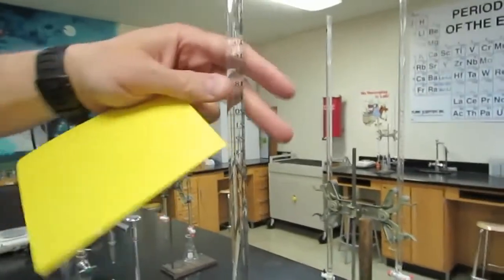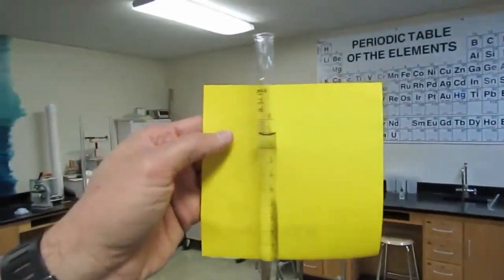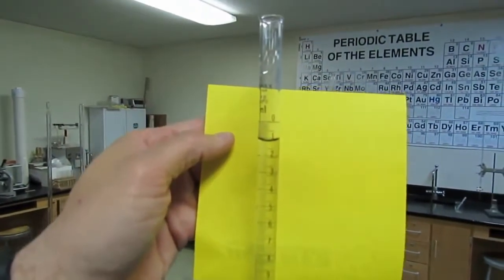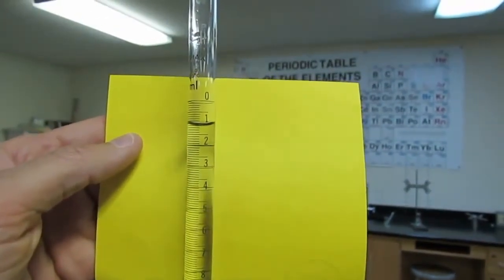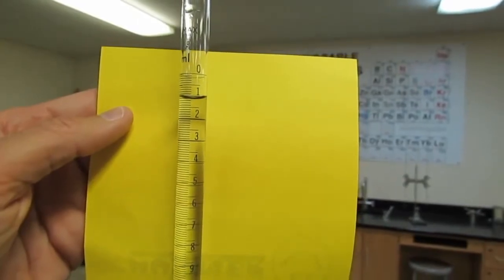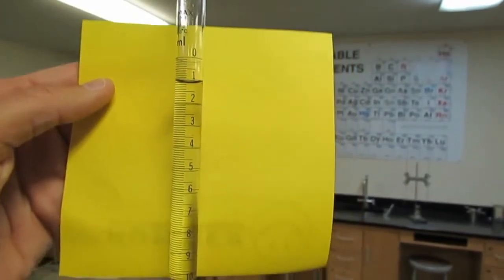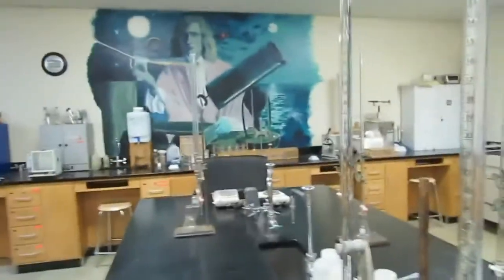For my initial acid reading, let me turn the burette so we can read that. It looks like that's going to be between 1 and 2, so I'm going to call it 1.16. So I have my initial acid and my initial base value.